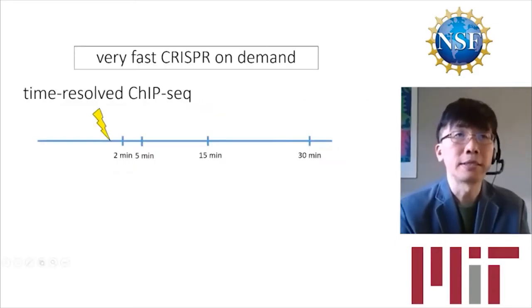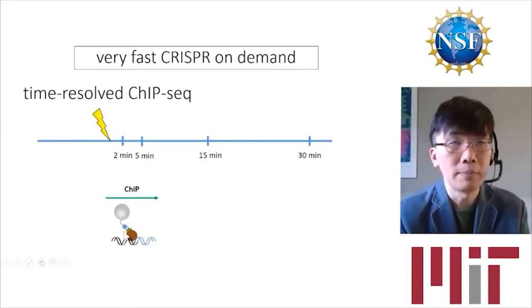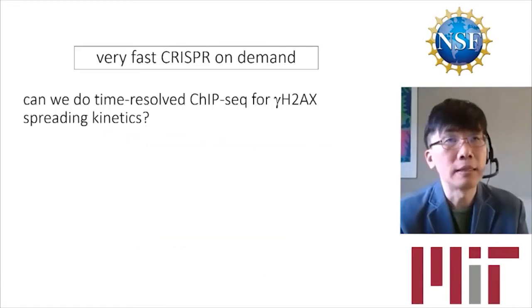And here's an example. We developed a time-resolved ChIP-seq method where we create a break using light, and then we harvest the cells at different time points. And then we use antibodies against a protein of interest, in this case, phosphorylated H2AX, to collect the chromatin fragments. That's chromatin immunoprecipitation, ChIP. Then we sequence the fragments and align to the genome to build a ChIP-seq map along the genomic coordinates. And the question is, can you use this time-resolved ChIP-seq to determine the spreading kinetics of gamma H2AX?